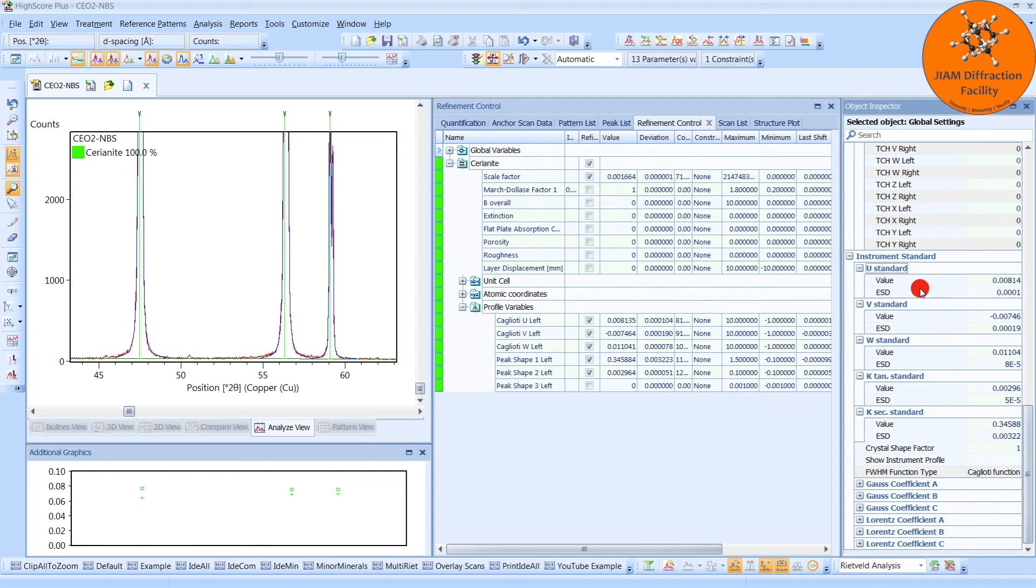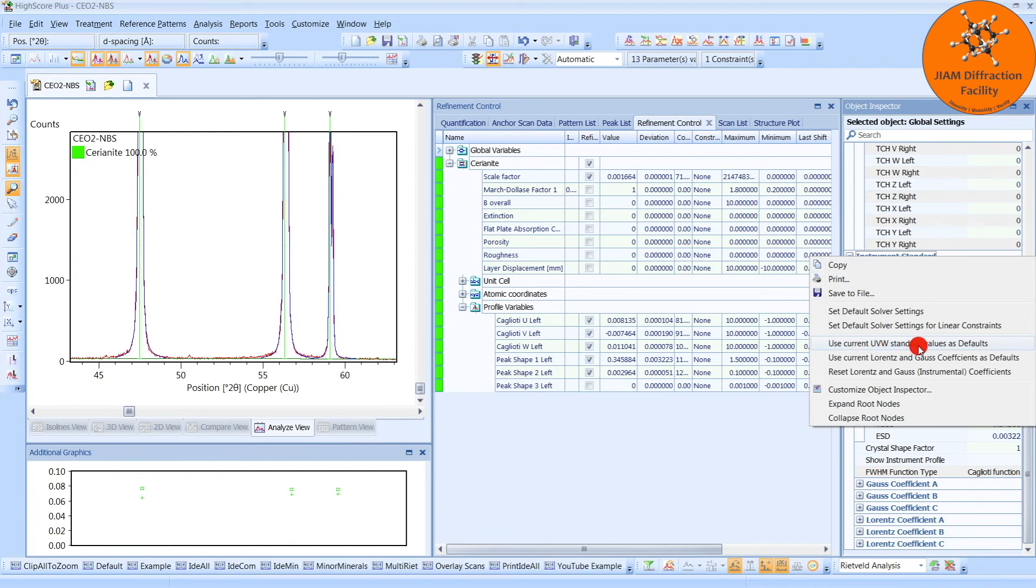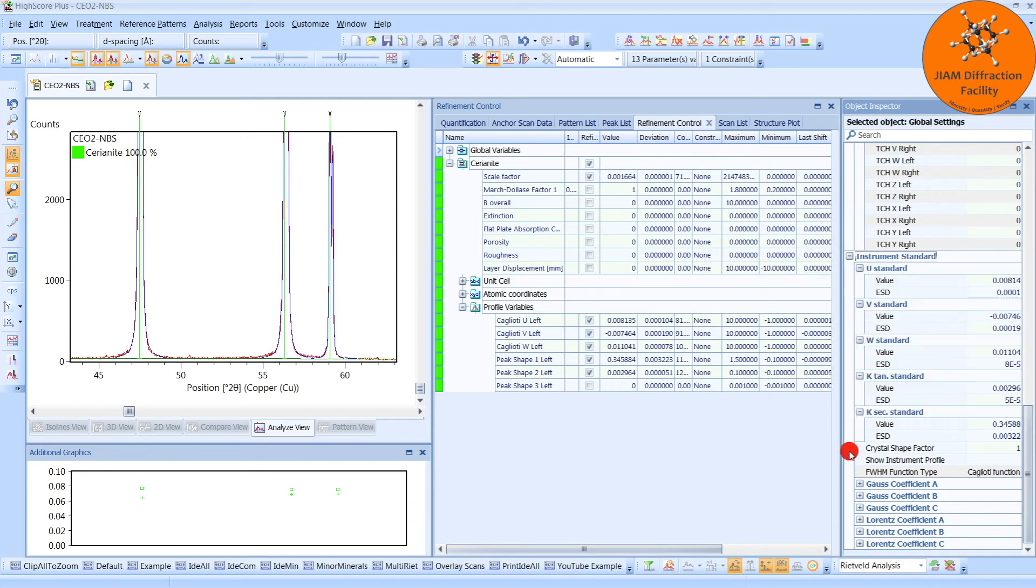Let me point out that if the vast majority of your samples all use the same instrument and the same optics, then what you can do is come in here and right-click, and then choose use current U, V, W standard values as defaults. If you choose this, then every time you open HighScore+, these values will automatically appear as your instrument standard.